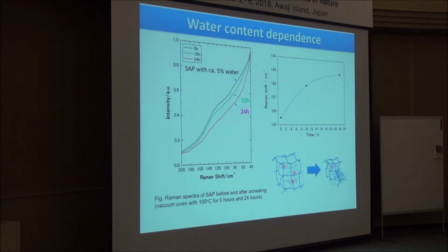So it may be considered that the peak at 126 wave numbers shifts to a higher frequency with time in the vacuum oven.